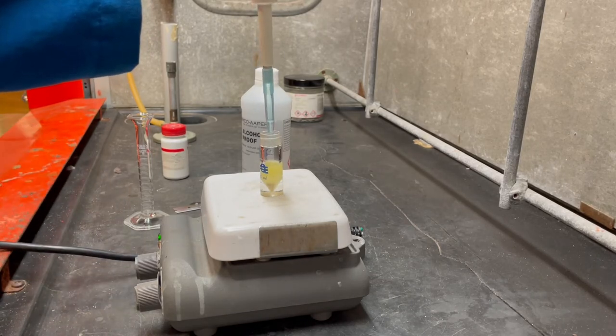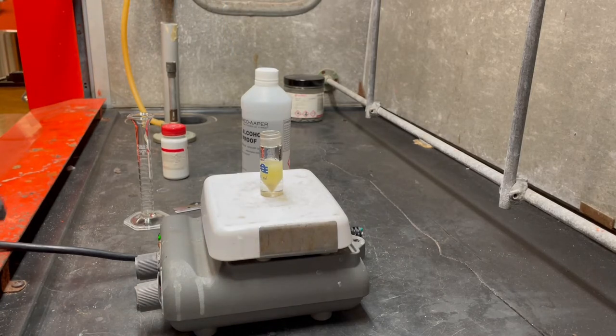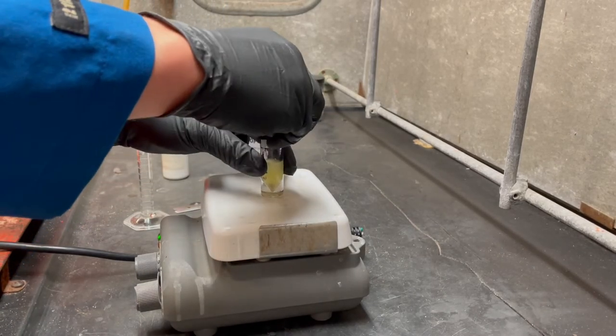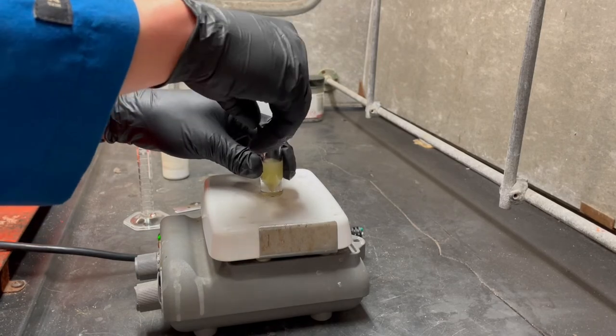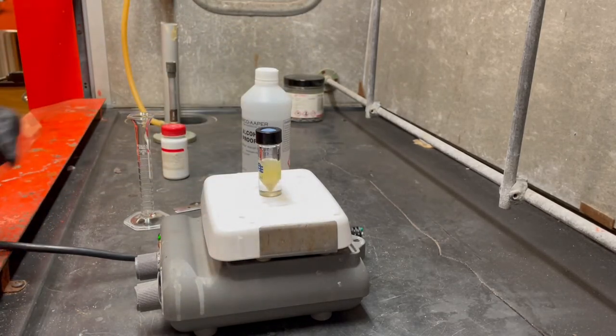I also want to add it kind of quick, just so that I don't let so much air and moisture from the atmosphere get in here. You saw that it turned color initially, so we actually want that yellow color to persist, okay? And that's an indication that the ylide forms, okay? So I'm gonna let that stir for about 15 minutes, okay?